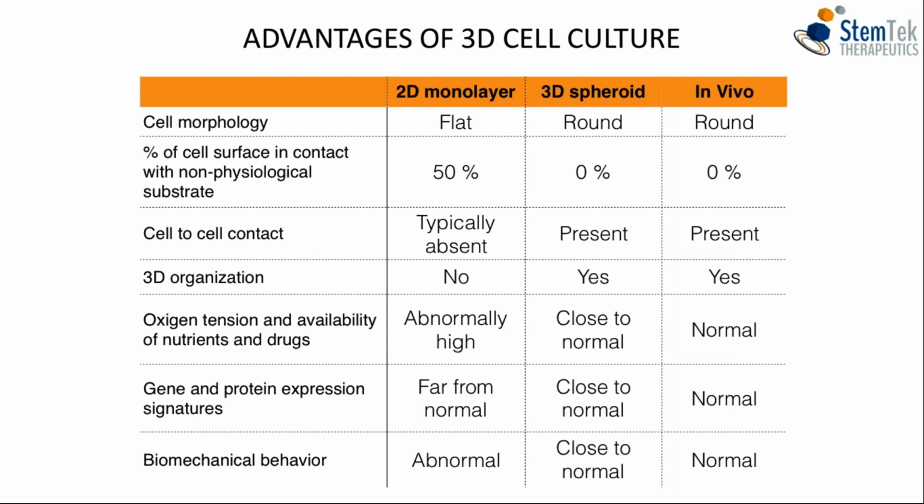I'm talking all the time about 3D spheroid culture as 3D cell culture. There are different forms of recreating this 3D architecture in vitro. However, basically it can be divided in two, which is scaffold-free and scaffold-based. But I'm most of the time just looking into ways that we can recreate this structure in a way that is robust and effective for drug screening.